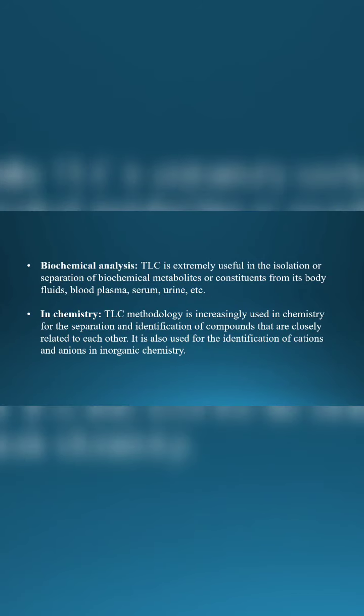Biochemical analysis. TLC is extremely useful in the isolation or separation of biochemical metabolites or constituents from body fluids, blood plasma, serum, urine, etc.